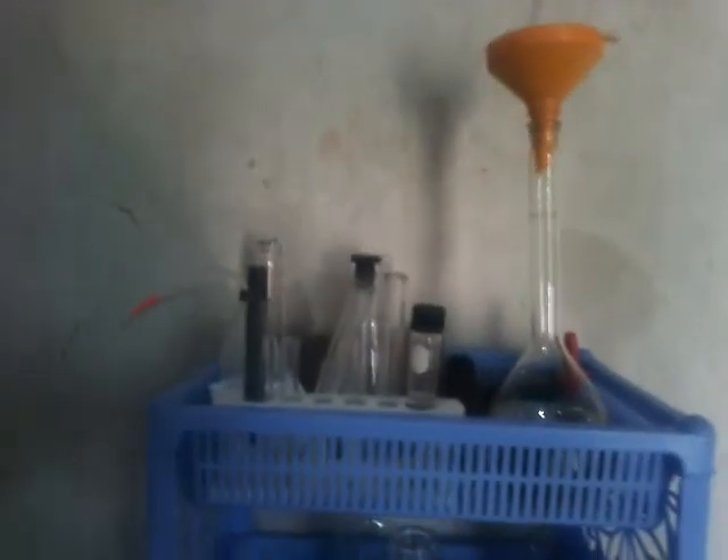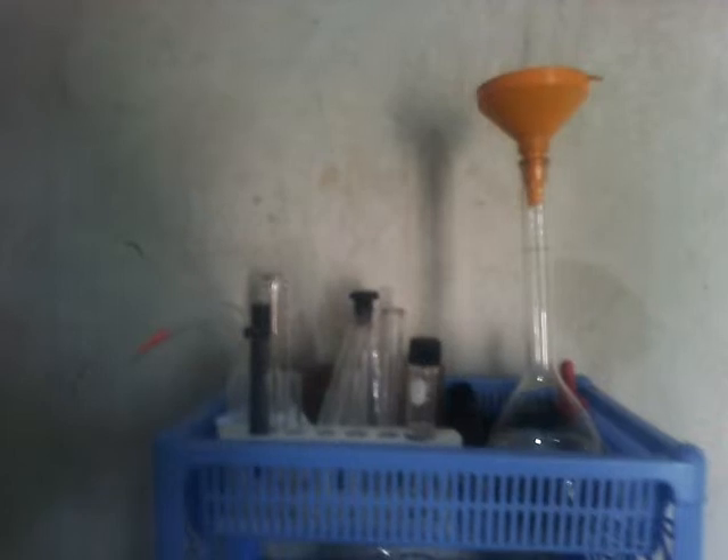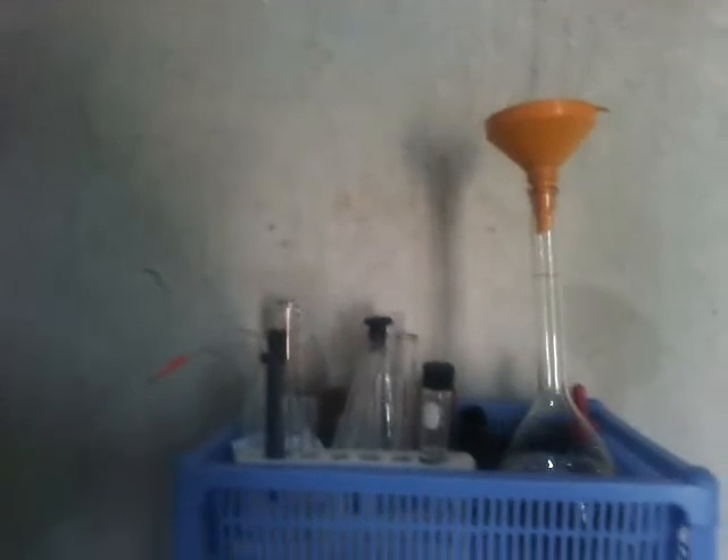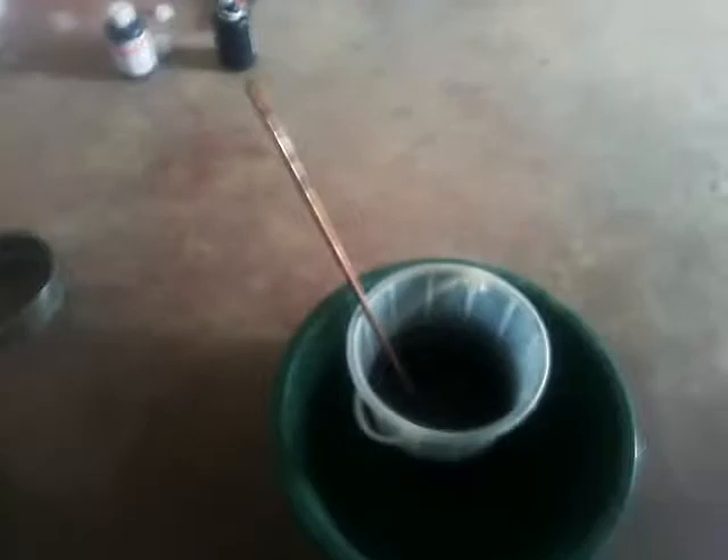I'm going to precipitate it with sodium metabisulfate, precipitate that out, then take a weight of what it was before and what it was after. That should give us an idea of the purity of the local gold. When I'm done I should be left with 99.99% gold — that would be the key.